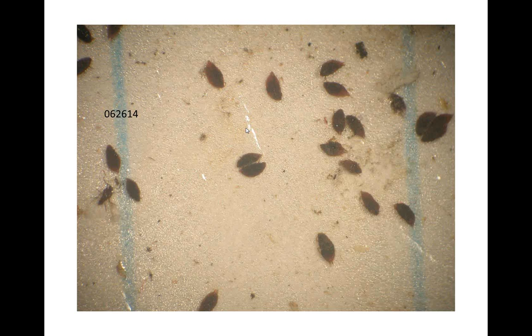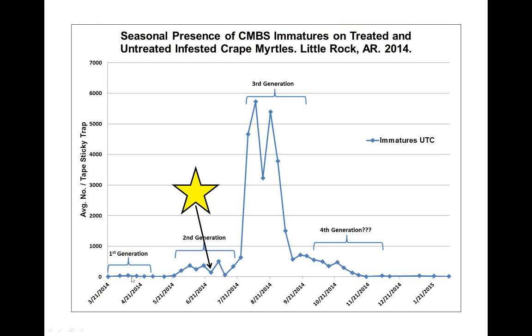I think a reasonable estimate is the best way to go when you have too many to count. Yeah. Do we want to pick a particular number, let's say if it looks like there's over 1,000, then you only count up to 1,000 of the scales, and then whatever area of the tape that 1,000 covered, use that to scale up, kind of thing?